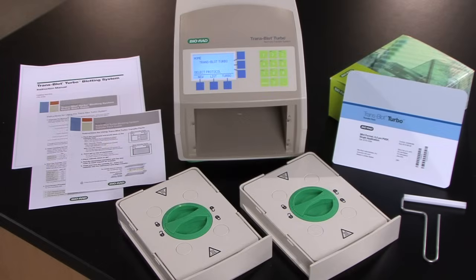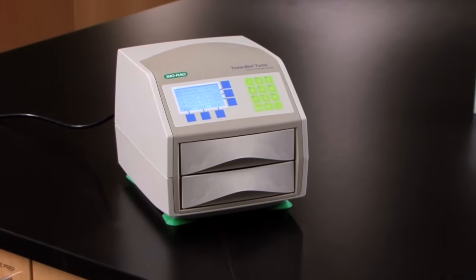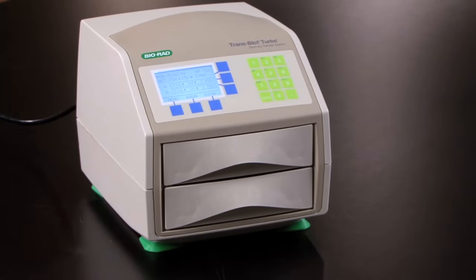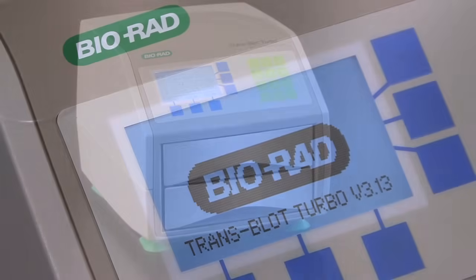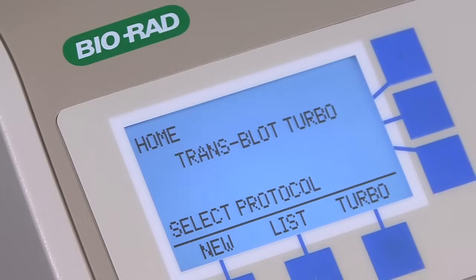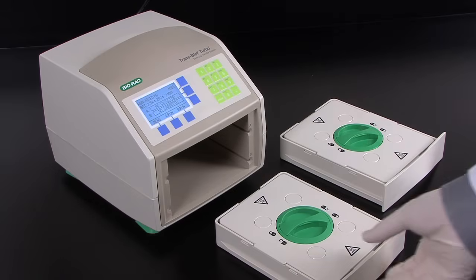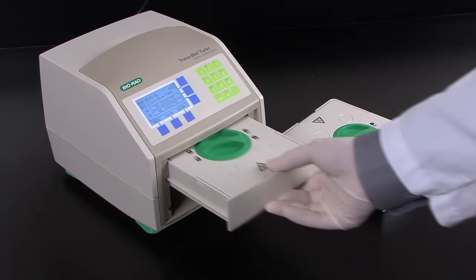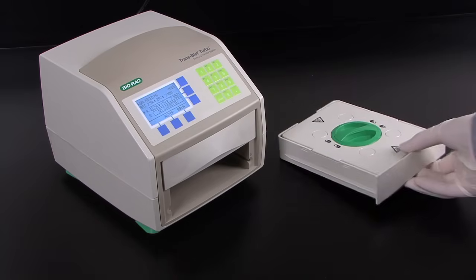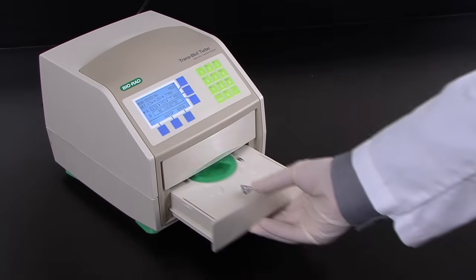When you purchase a trans-blot turbo system, you will receive several items. One item is the base unit, which contains an integrated power supply, eliminating the need for a separate power supply. The unit also includes an LCD screen and keypad, allowing convenient access to the turbo transfer protocols and software features. The unit has two bays that hold the transfer cassettes. Two transfer cassettes are included with each system and additional cassettes can be purchased separately.